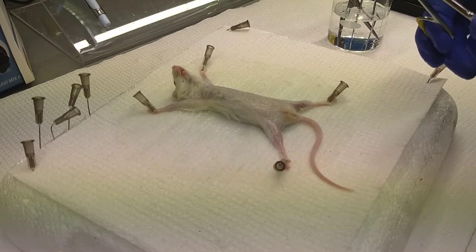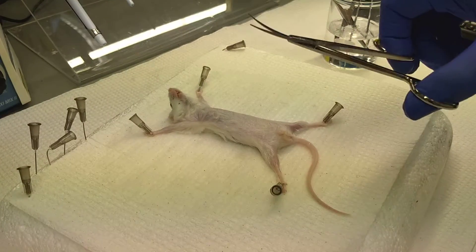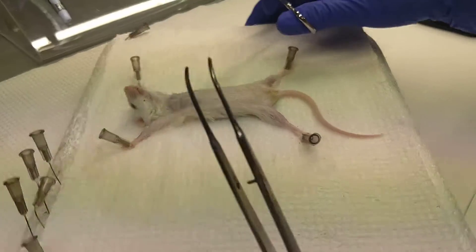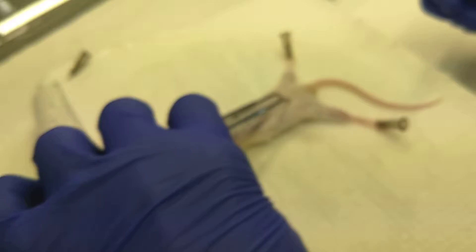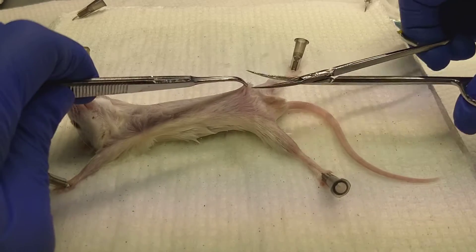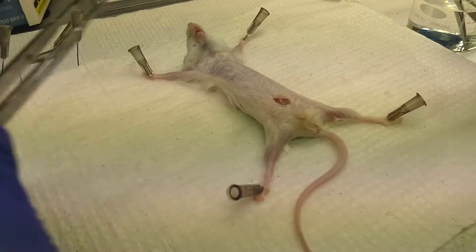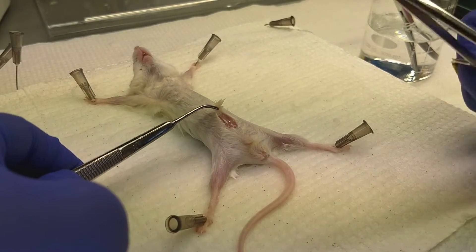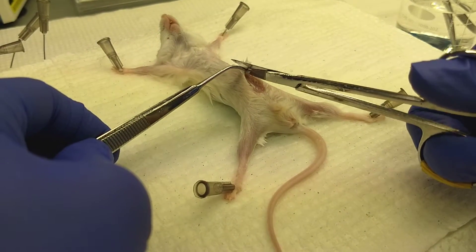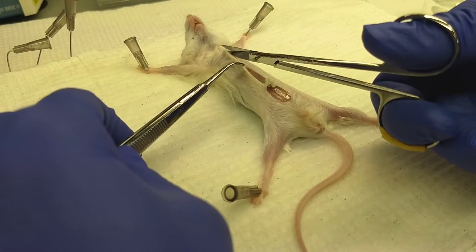I'm going to use scissors with curved blades — that helps to not cut the peritoneum — along with forceps. You're going to grab just the skin and pull it taut, which will help you not cut the peritoneum. Then make a small incision to cut away the skin, making sure the blade of the scissors is pointed up, being very careful not to cut through the peritoneum — just cut open the skin.